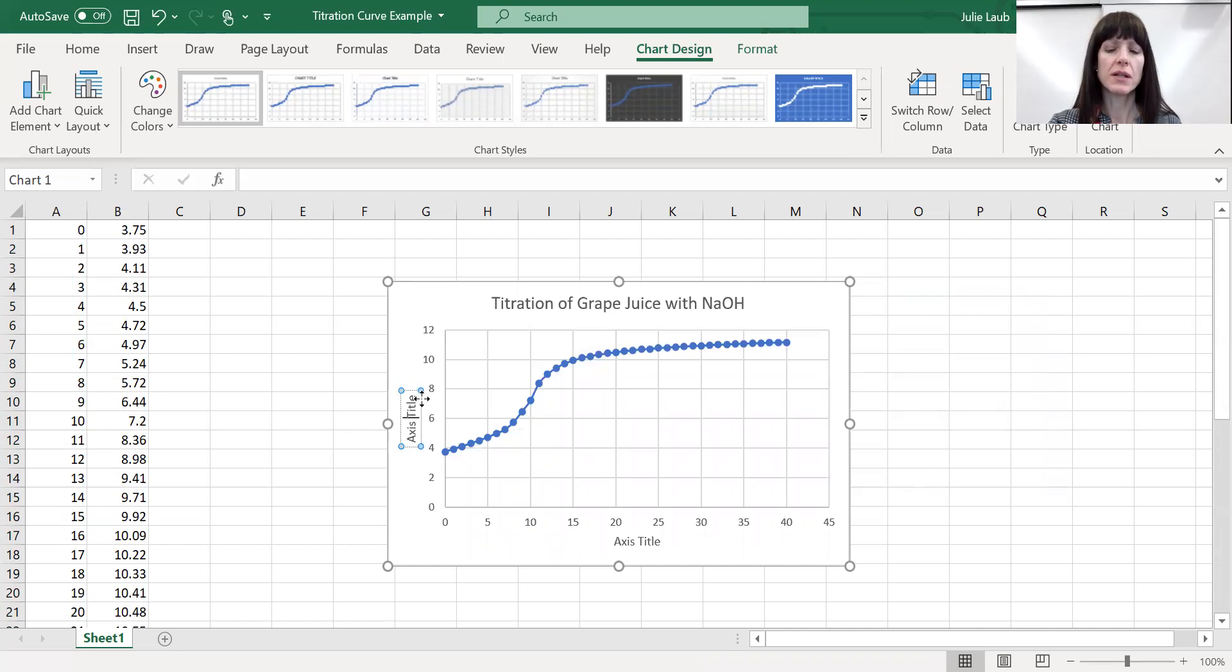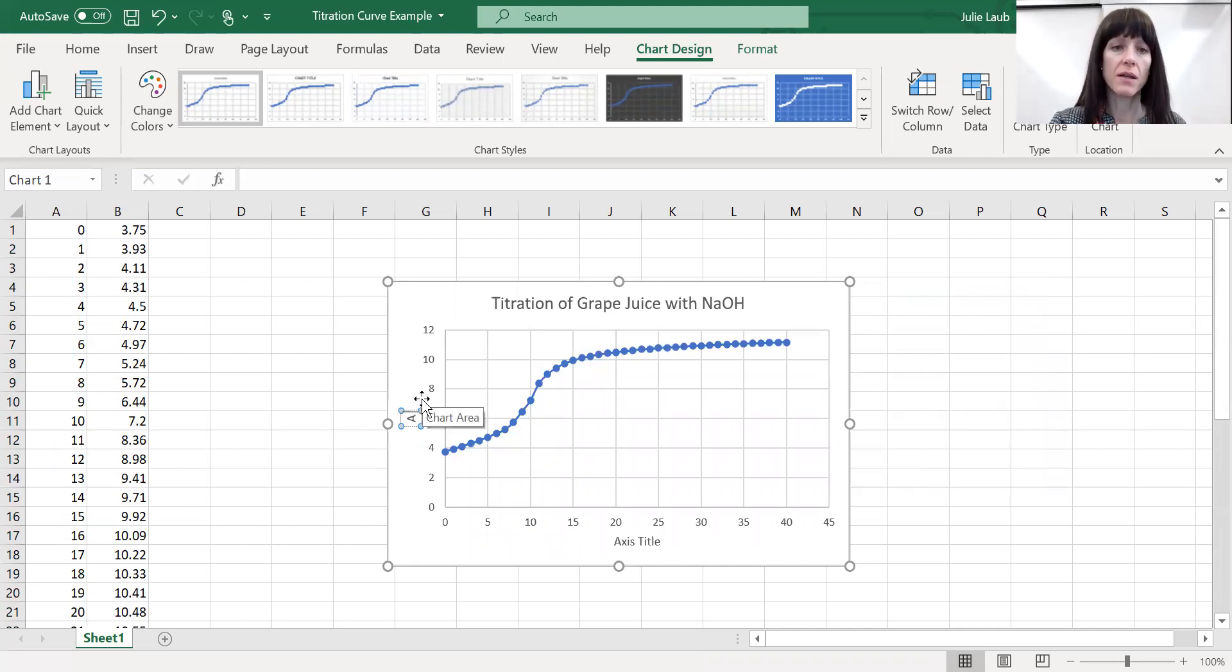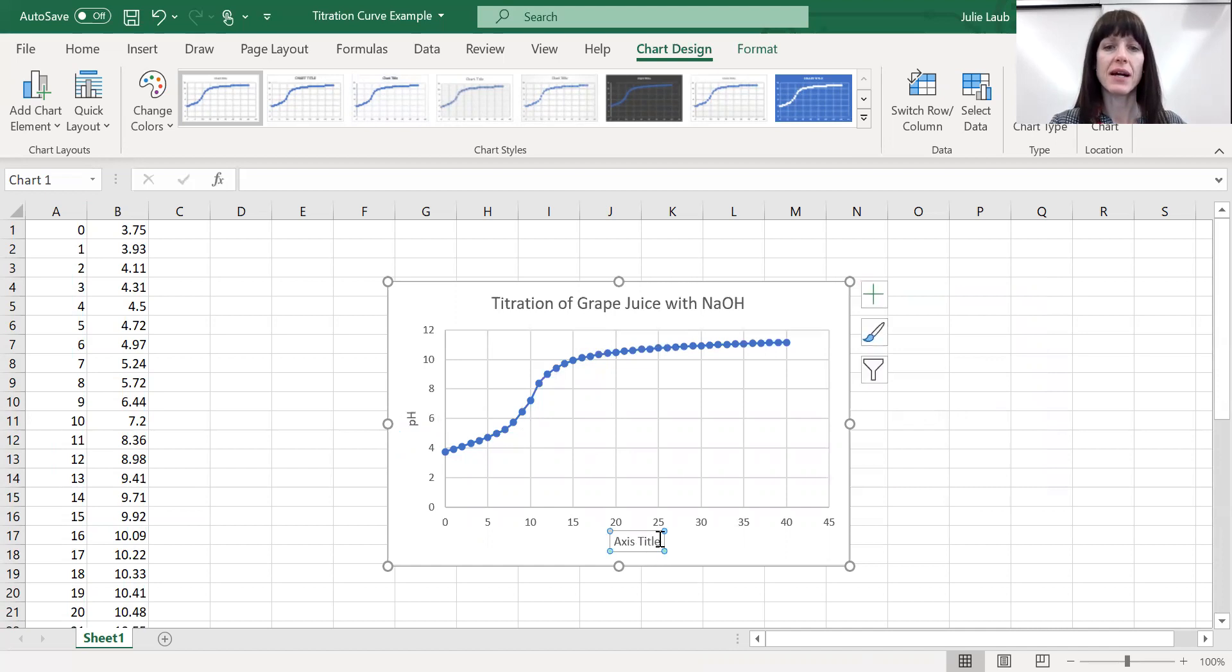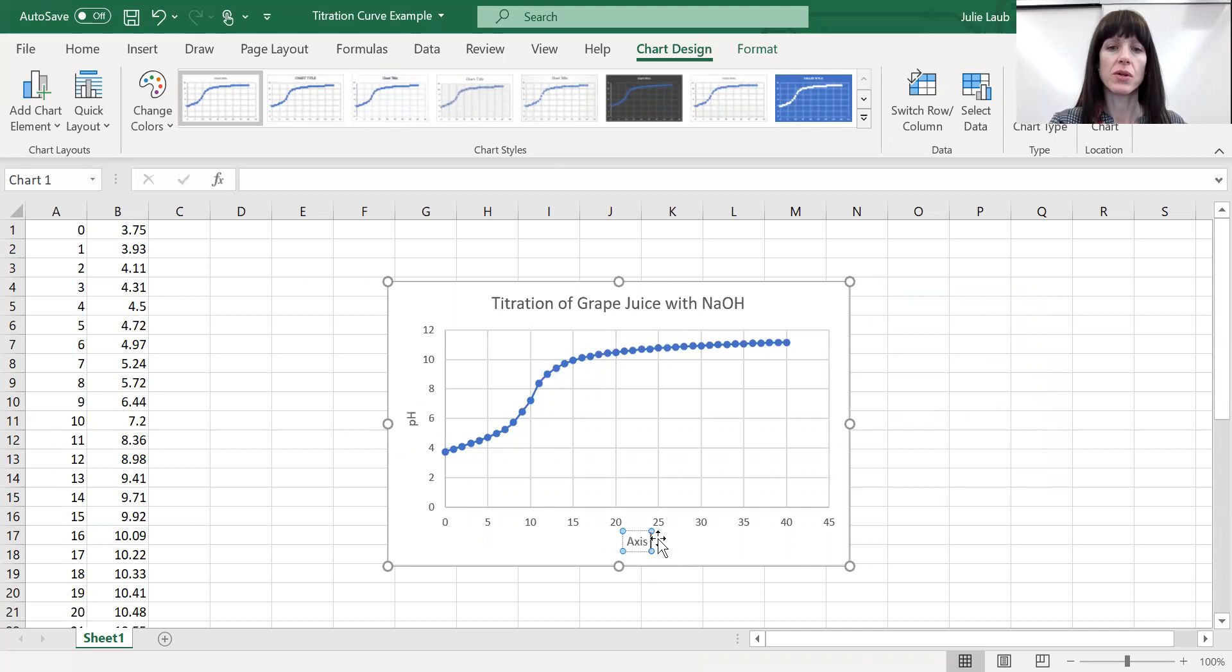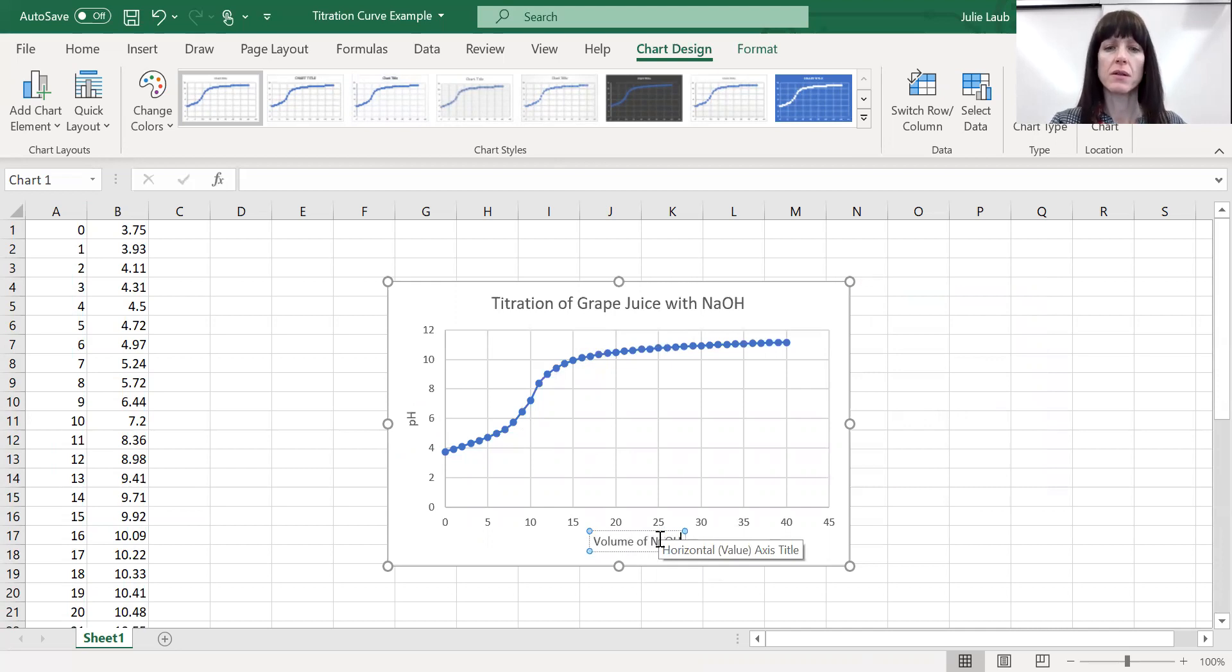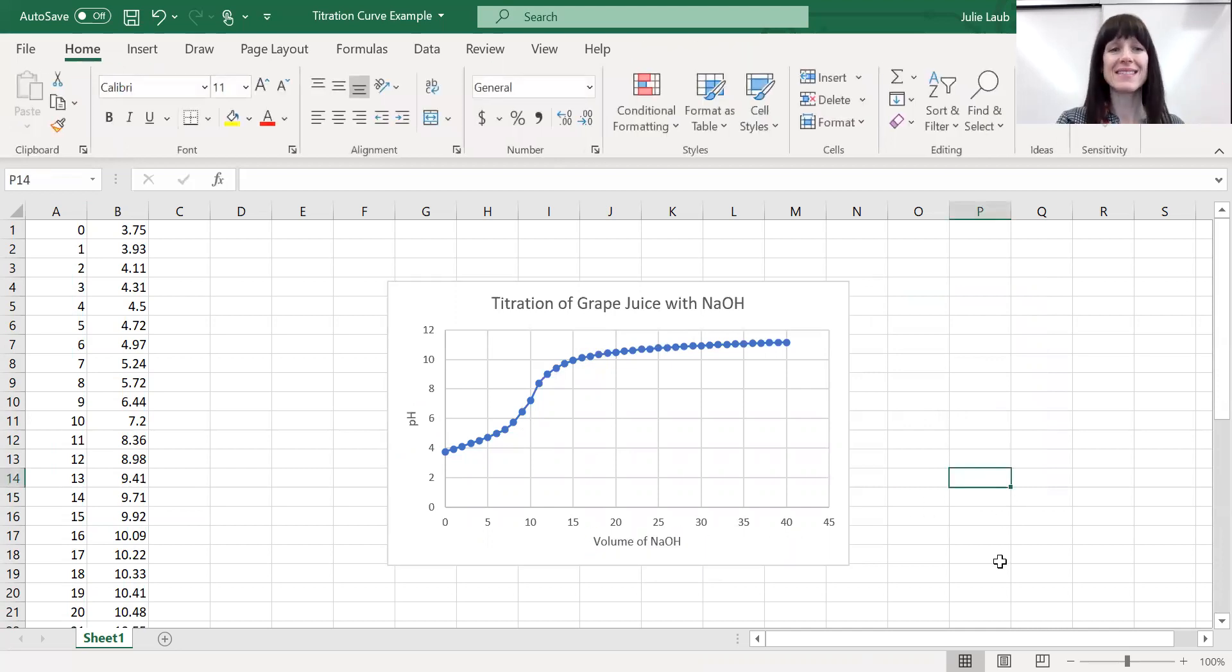So when you click inside of here and my, there we go. My y-axis was pH. So when you put pH there, my x-axis, let's clean this up a little bit too, is going to be the volume of the sodium hydroxide that we delivered. Okay. And nice. There you have it.